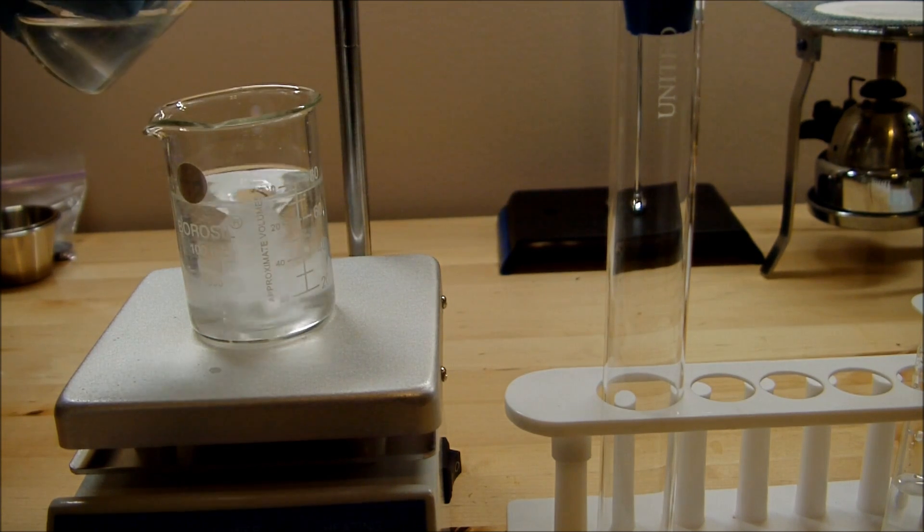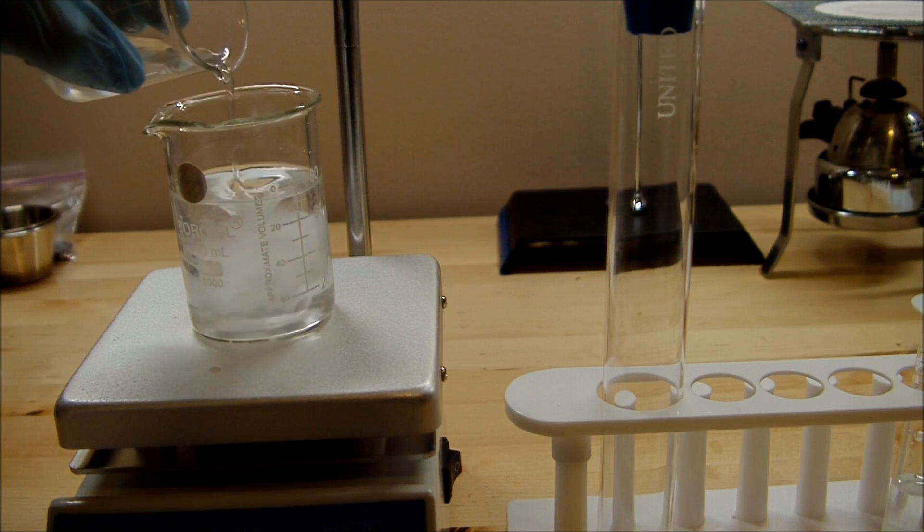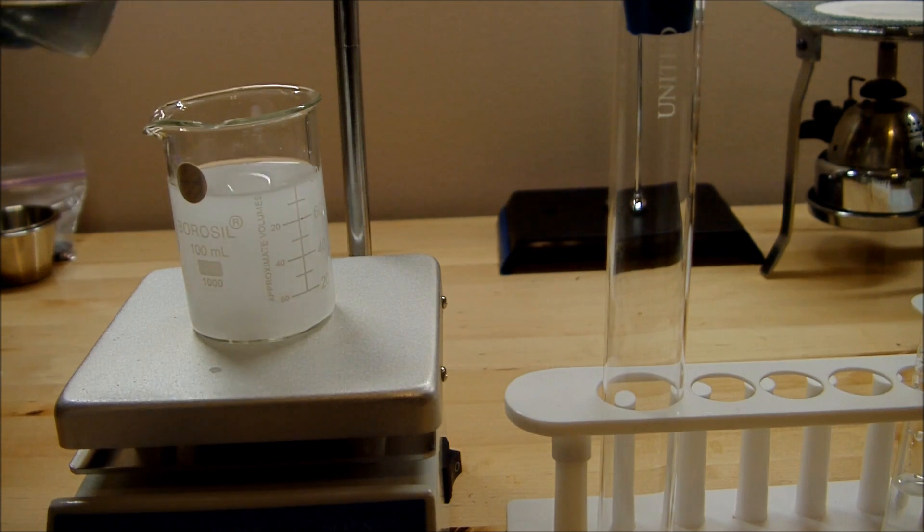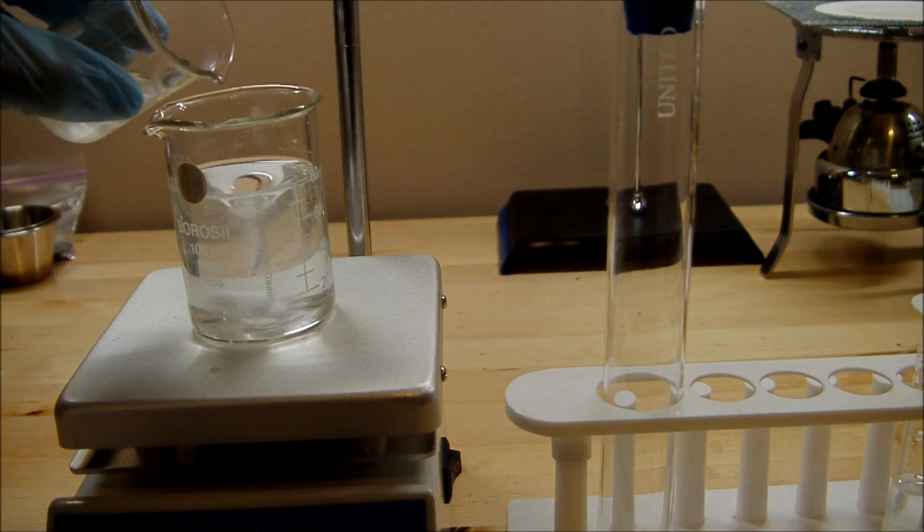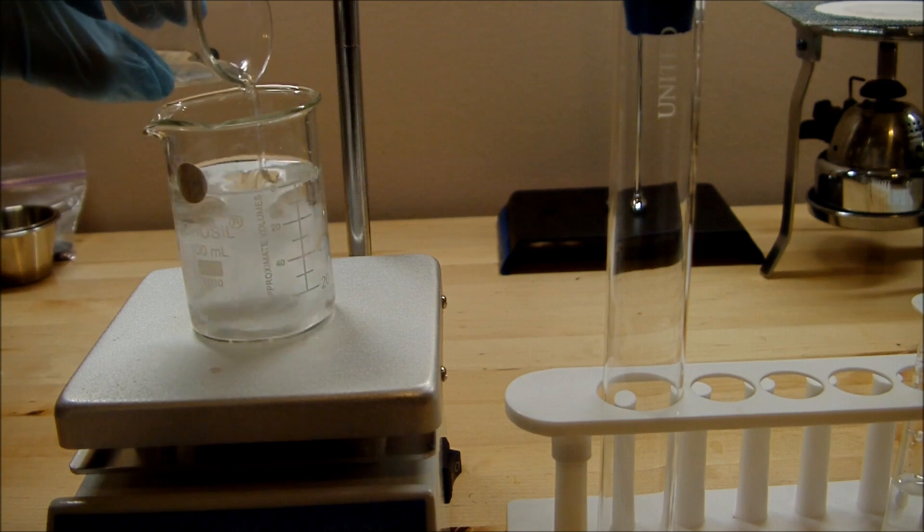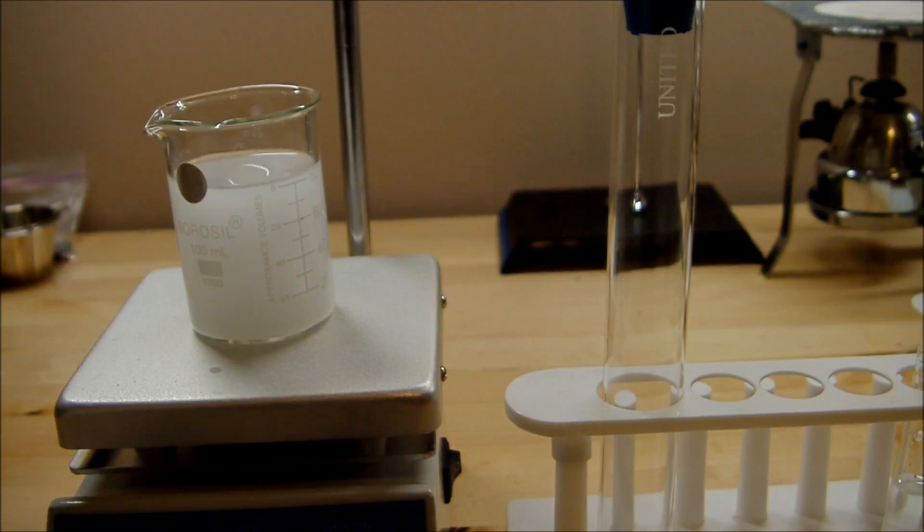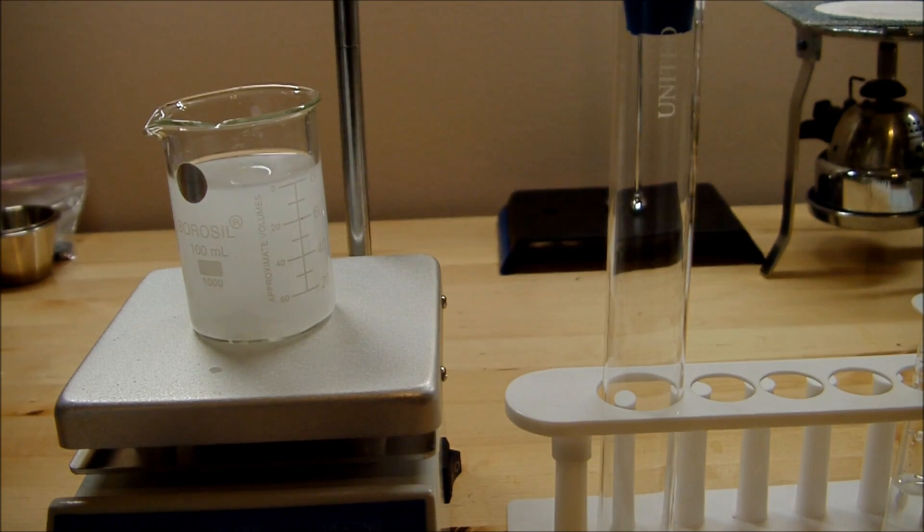The idea is that the solubility of chemicals changes based on factors such as temperature and pressure. So when those change, it should change the precipitation that goes on in the storm glass, and it'll form different patterns based on what the approaching weather is supposed to be like.